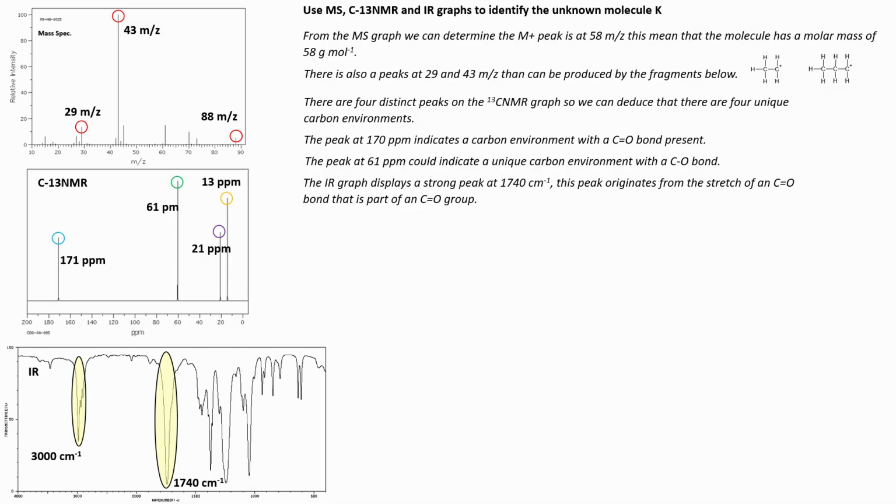Okay, the other peak we see here, we're just going to label this, but this is going to be present in most molecules you look at, and that's the carbon-hydrogen stretch at around 3000. We usually don't use this to identify specific structures in a molecule because just about all the molecules we look at do have carbon hydrogens. But if there's an absence of it, we can say that there's not a carbon and hydrogen bond.